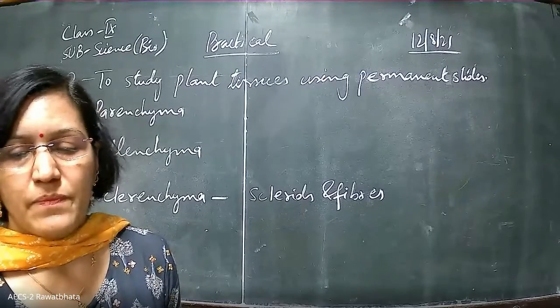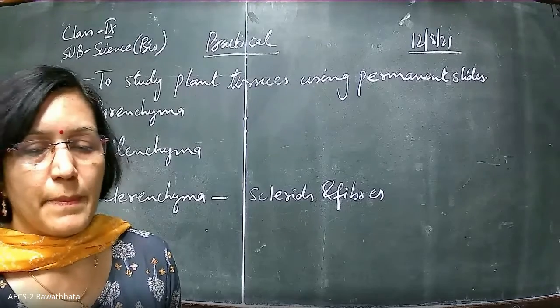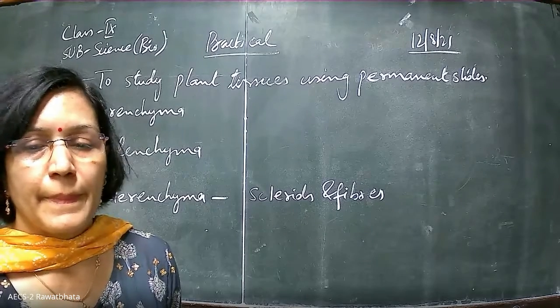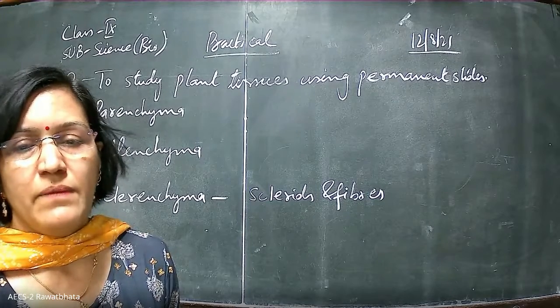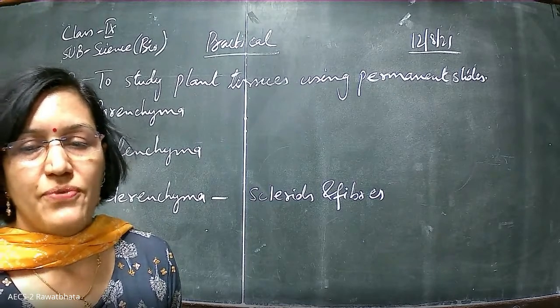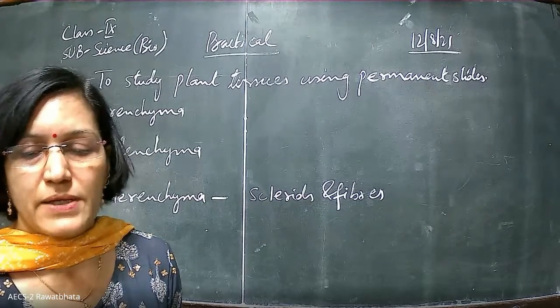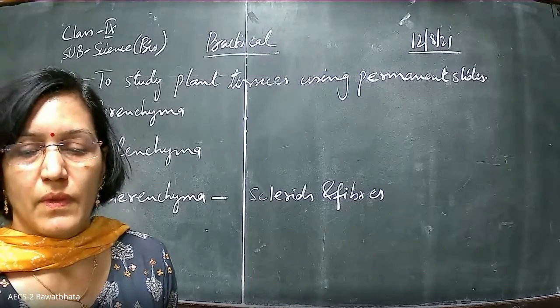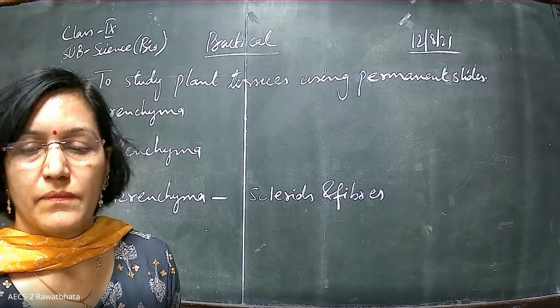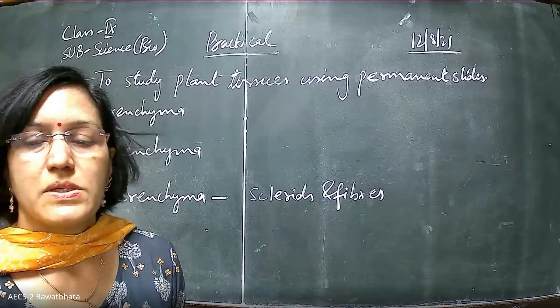Now let's see for sclerenchyma. And here I'll be comparing sclerenchyma with that of other cells. So first of all, let's have a look at this sclerenchyma.